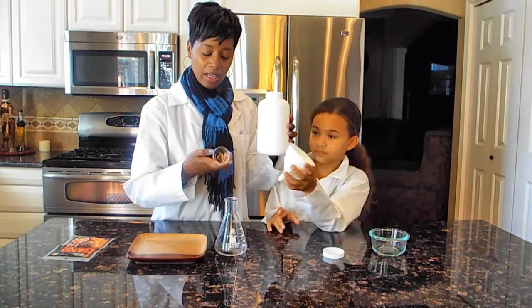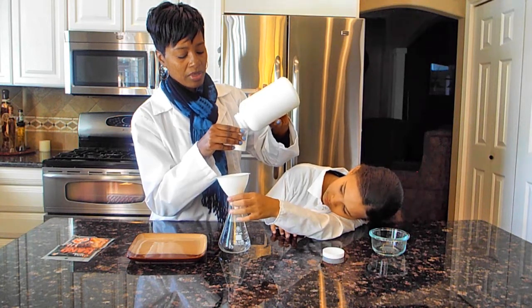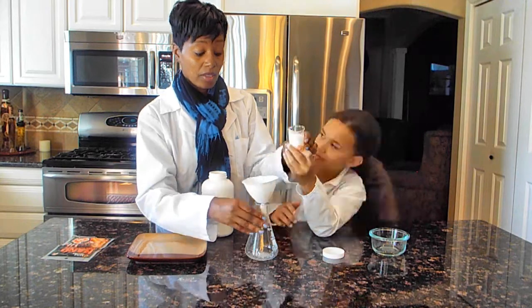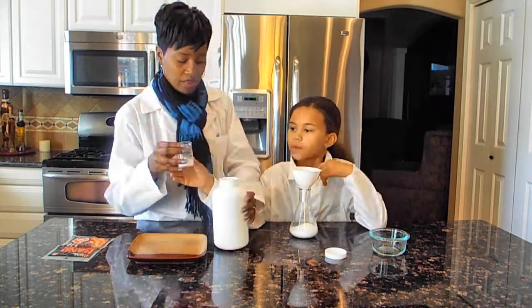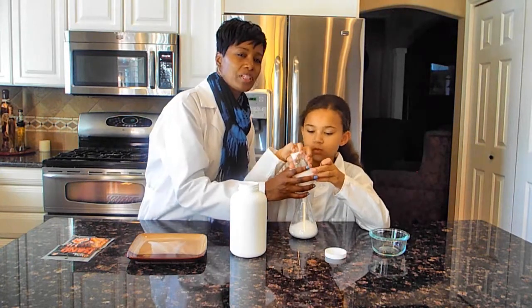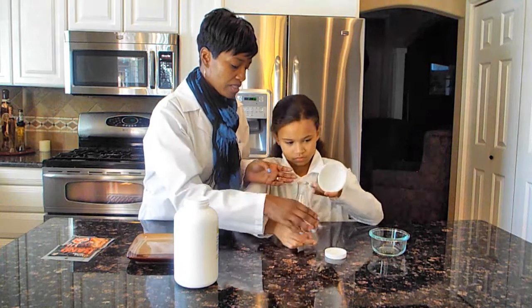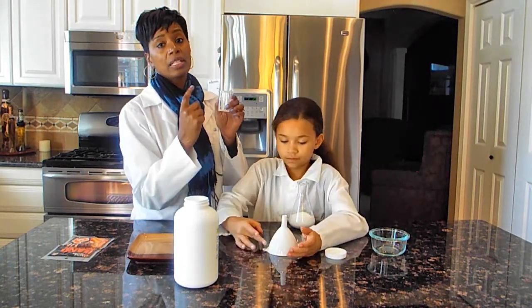It's about three of these beakers' worth. We're going to put it into the flask — it doesn't have to go all the way up. Next I'm going to get 30 milliliters of water.